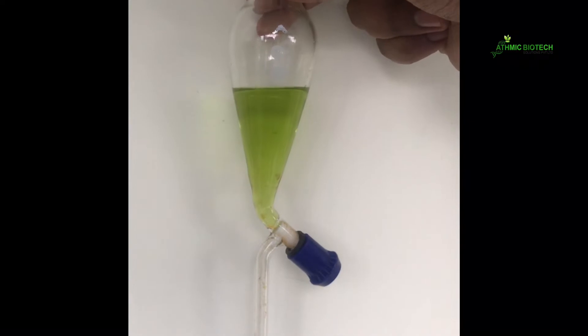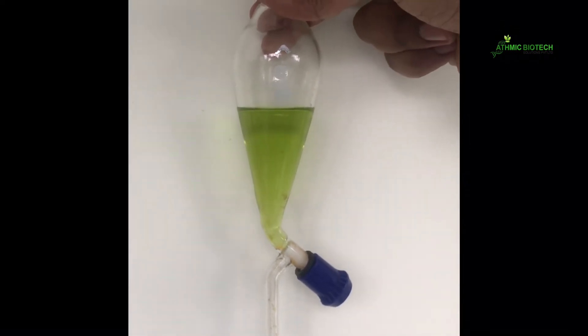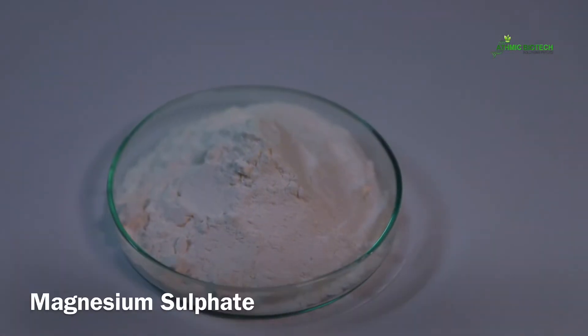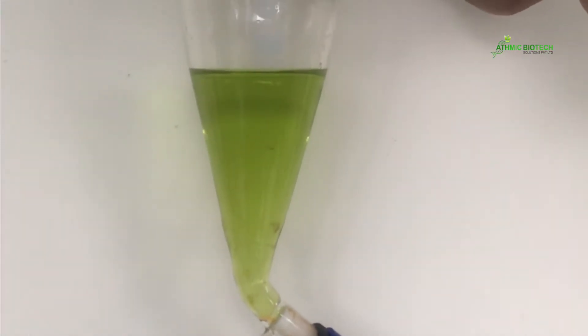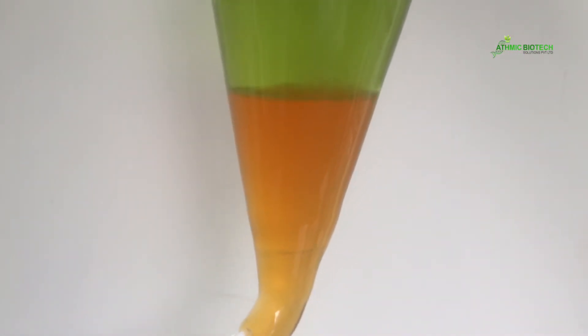The acetone extract is collected in a separating funnel. Then a few pinches of magnesium sulfate are added to remove the water content in the separating funnel. Added excess hexane to separate into two layers.